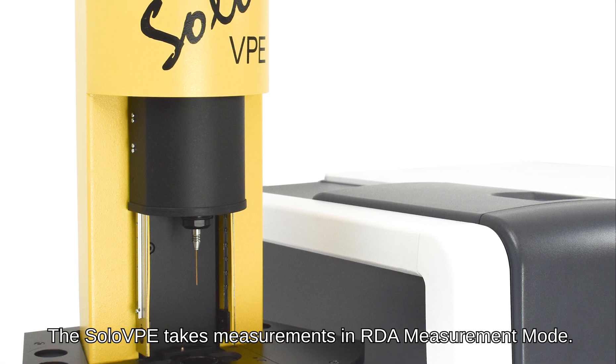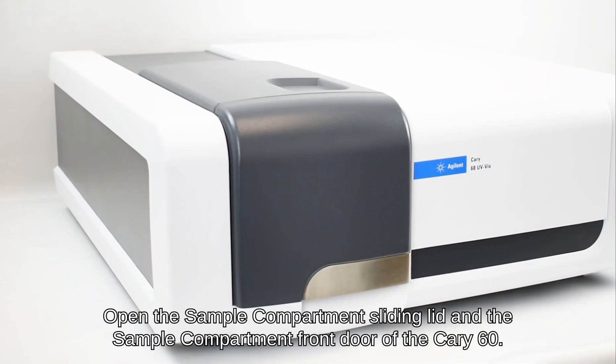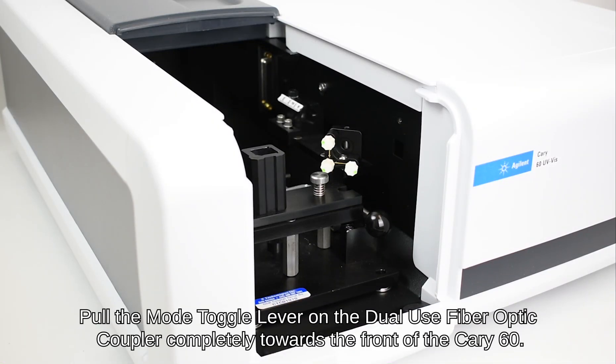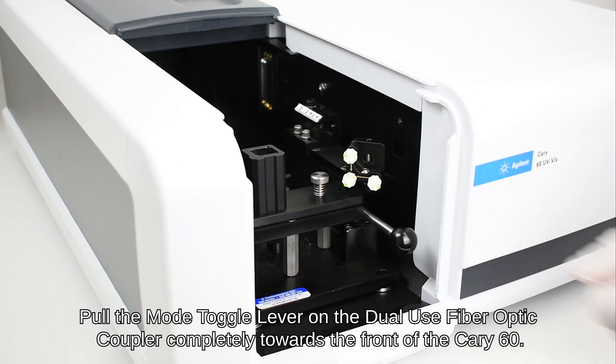The Solo VPE takes measurements in RDA measurement mode. Open the sample compartment sliding lid and the sample compartment front door of the Cary 60. Pull the mode toggle lever on the dual-use fiber optic coupler completely towards the front of the Cary 60.